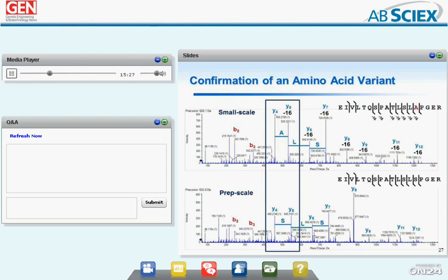MS-MS is pretty much the staple of identifying any of these sequence variants, but for much of the part, the intact mass really leads us in the right direction to which amino acids are possibly being mutated based on the mass shift.